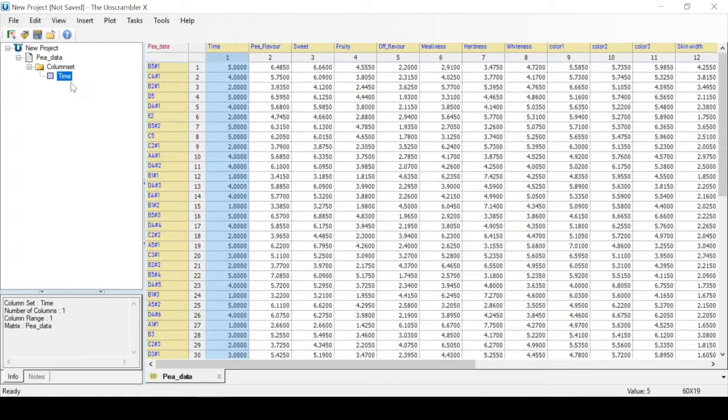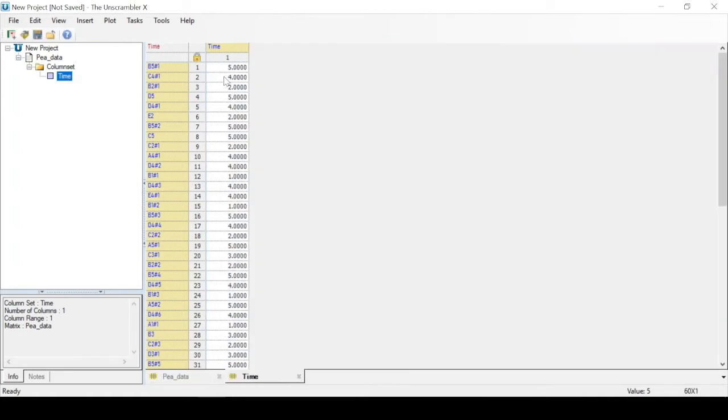We'll call this time, and if we now then click on this column set, only the information tied to the column range is displayed.